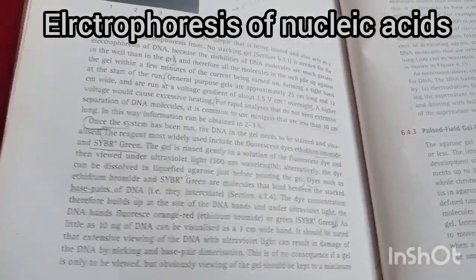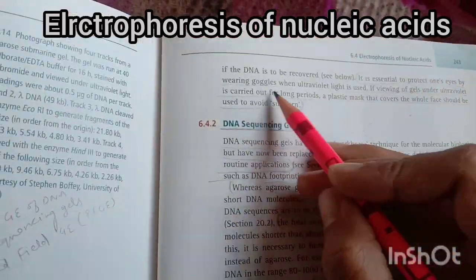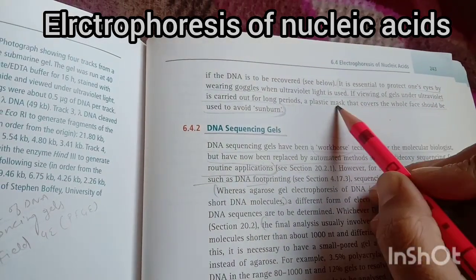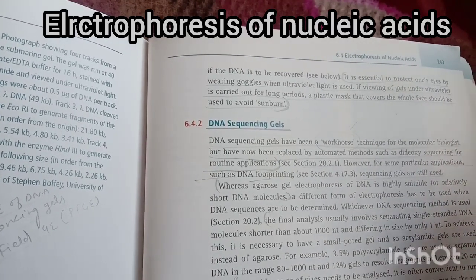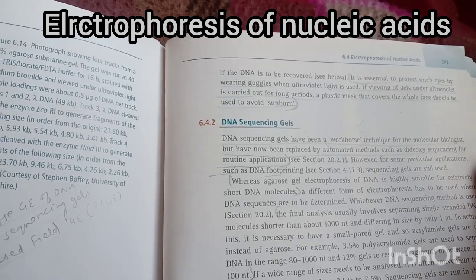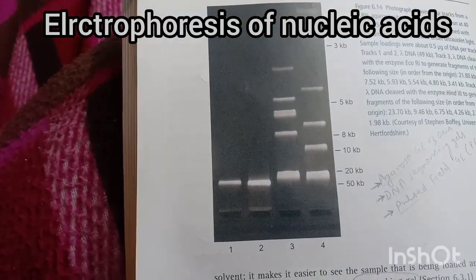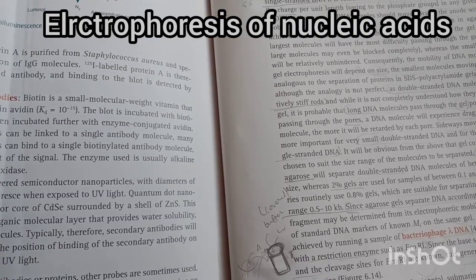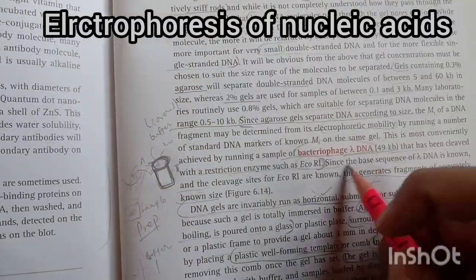Now some precautions. It is essential to protect our eyes with goggles, and if working with ultraviolet light for a long time, we can use a plastic shield that covers the whole face so that we can protect ourselves from the ultraviolet light. Okay, so this is all about agarose electrophoresis. This is a photograph showing the tracks, figure 6.14. This is an experiment done with bacteriophage lambda DNA.